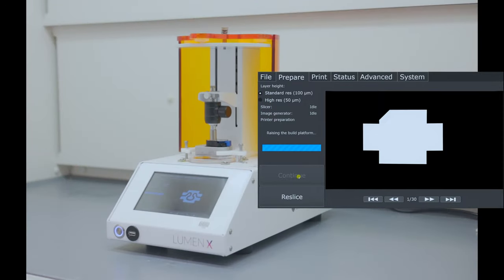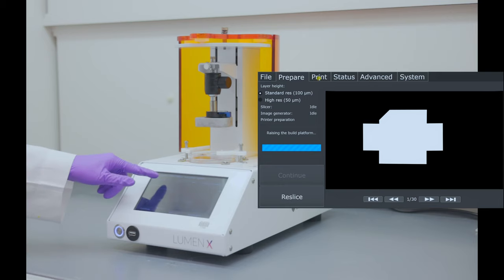Now, the build platform raises. Now, we go to the next menu, which is the print menu.